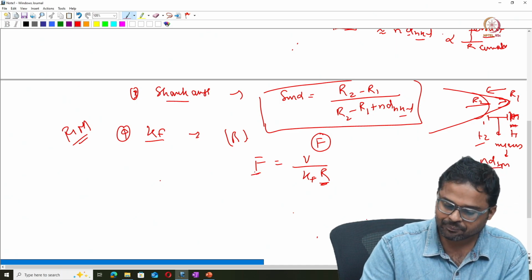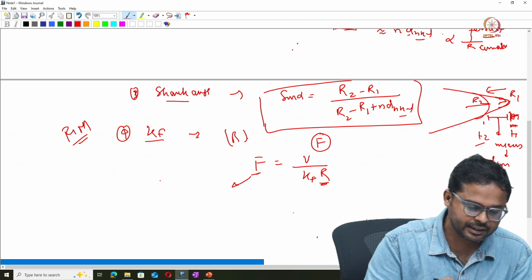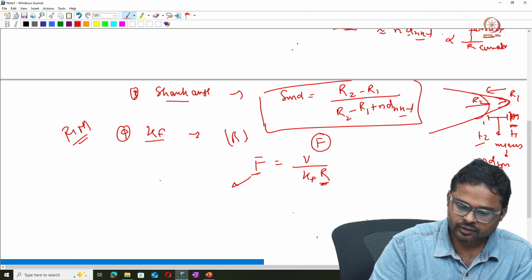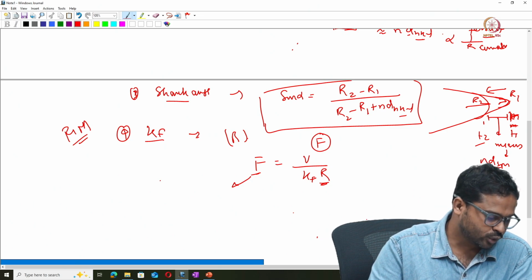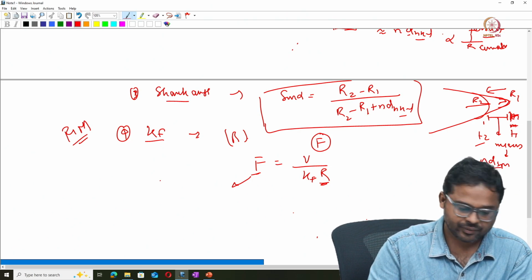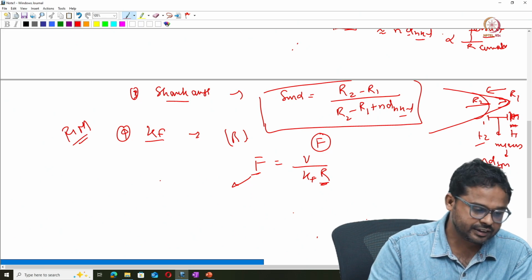What is the assumption? It is assumed that in FIM the field required to evaporate atoms from the surface is known to vary due to the presence of the imaging gas on the tip surface.